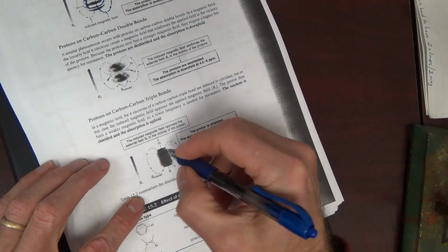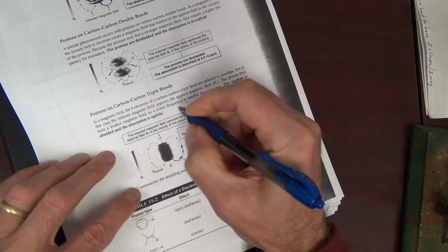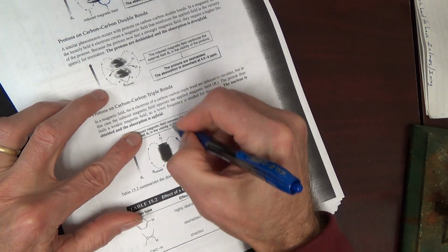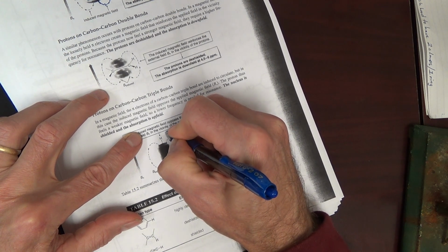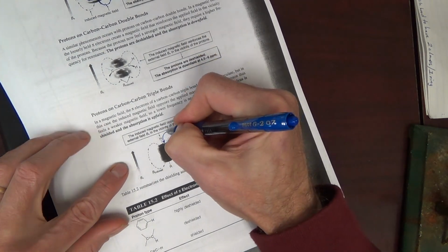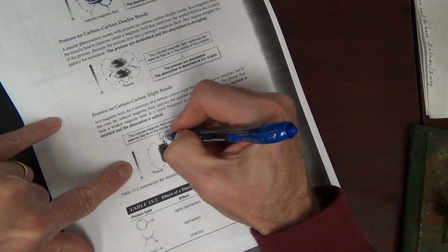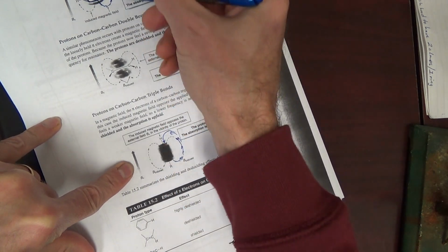Now, on the other hand, let's look at the alkyne. The alkyne, the electrons circulate in this manner. Okay? It turns out that the H, because the alkyne is linear, if we can make this bigger, like this, that's turning and circling, make that bigger. Where the H sits, the field is actually opposing the external, and opposing is the shielding effect. All right, because it's going to subtract. Up here it's actually adding to the external.